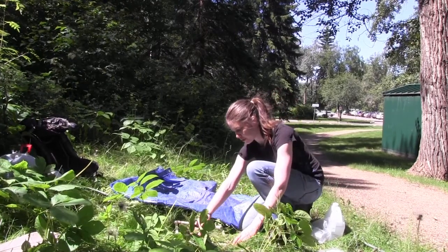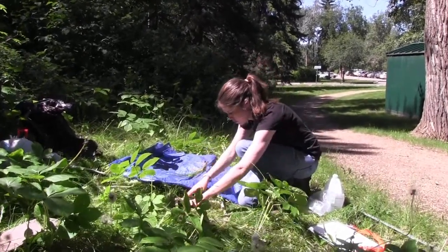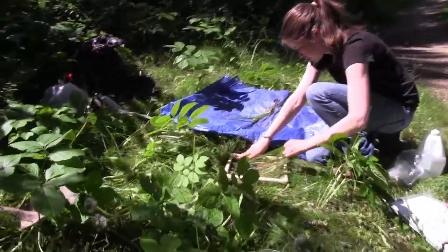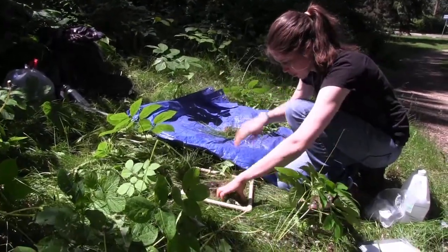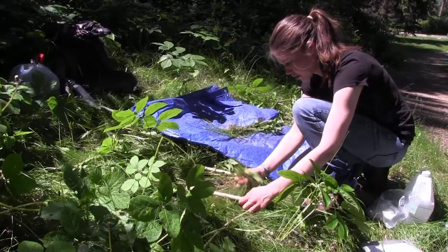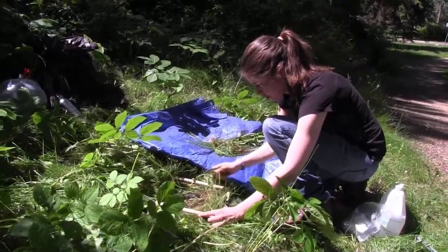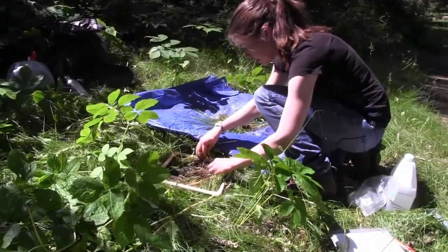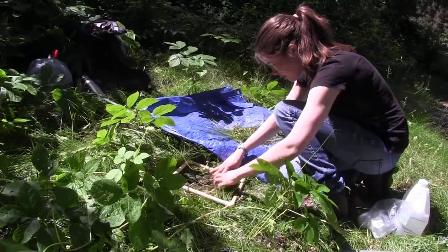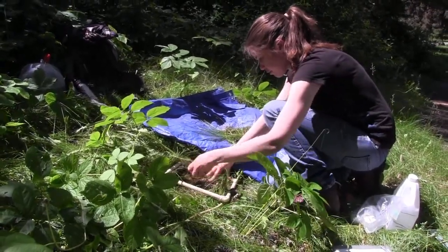Typically I'd remove the loose leaf litter and vegetation from the plot first, and put it on this tarp so that I can sort through it to double check that there are no earthworms present. If there were a lot of leaves, then this sorting could be quite time consuming, and there probably would be quite a few earthworms in the leaf litter.